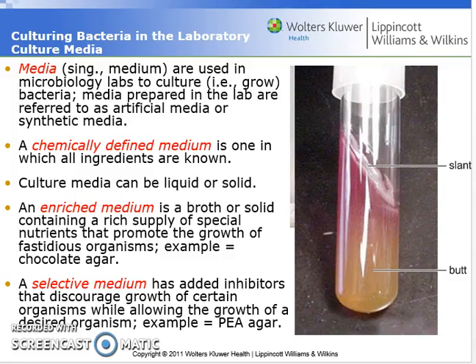Now, media is used to grow microbes inside of the laboratory. In nature, microbes pretty much will grow on anything. But with media, we have the ability to dictate what bacteria are going to eat. And so we refer to this as artificial media or synthetic media because the researchers are the ones who end up making the media to grow their bacteria.